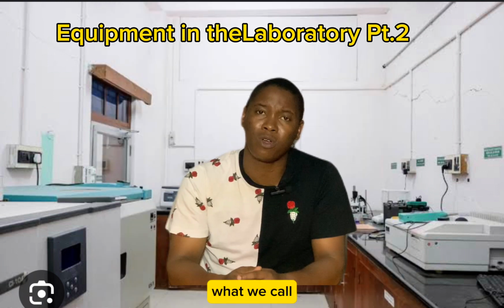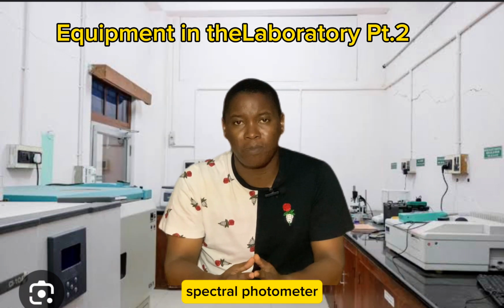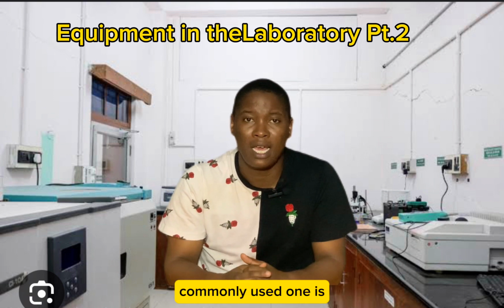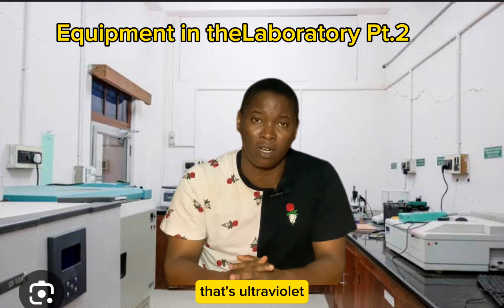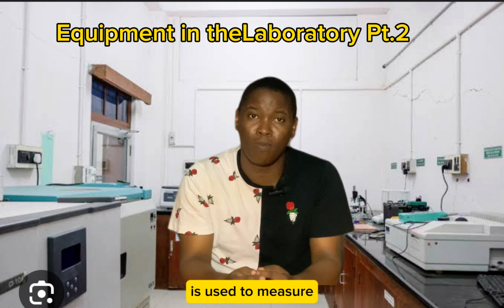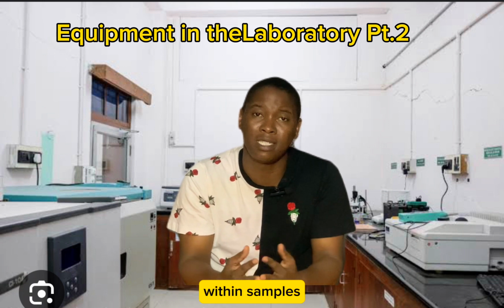We also have what we call a spectrophotometer. The most important or the most commonly used one is the UV spectrophotometer. That's ultraviolet spectrophotometer, and this is used to measure concentration of microorganisms. It's used to measure concentration of microorganisms within samples.